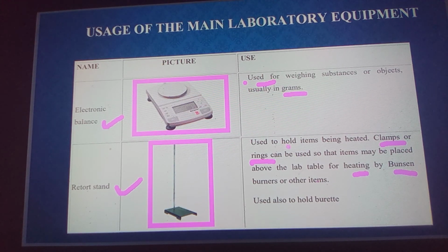Not only used in this case, but also we can use it to hold the burette. So these are two main uses of the retort stand. Let's continue.